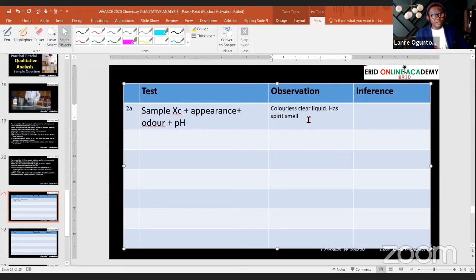About the pH of this particular solution. That's what we want to look at now. In talking about the pH of the solution, you want to tell me what pH is and give me 2 examples of substances and their pH.